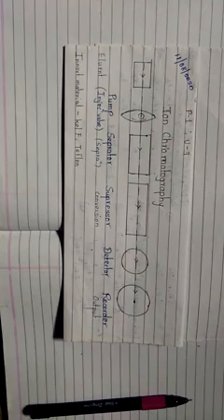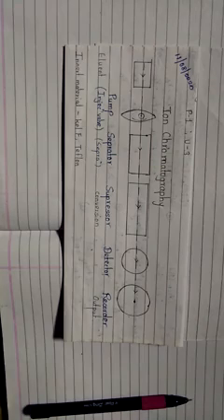This suppressor column point I will explain in a descriptive way. This is a separate question they ask you for the exam: describe the suppressor column or principle of suppressor column. When I explain this point, at that time you will understand it better.